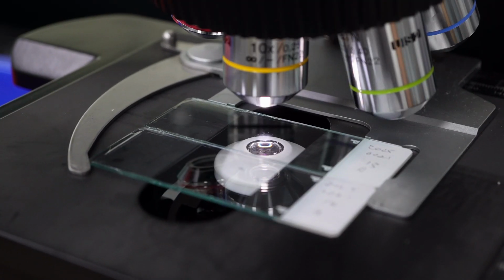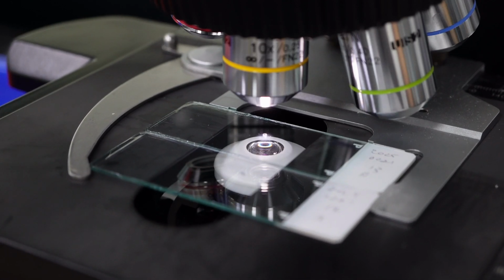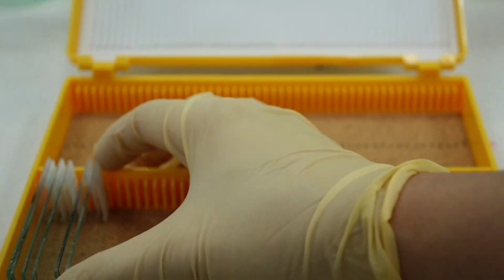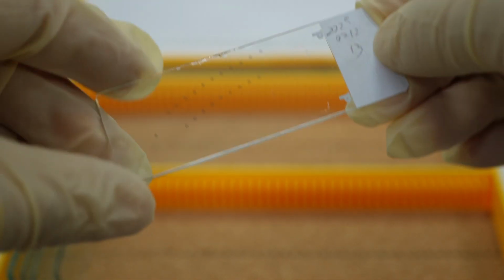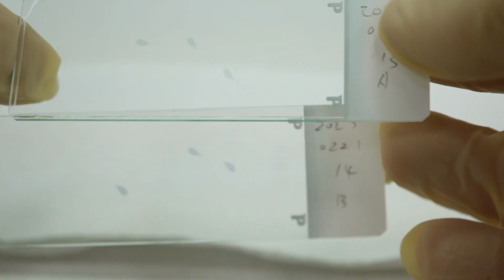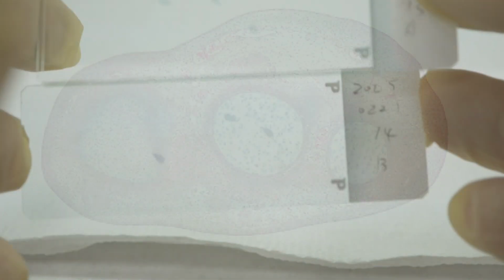And interpreting what you see, that's the next crucial skill. Right. How do you take these flat 2D slices and rebuild that 3D picture of the embryo in your mind? Well, that's the art and science of histology. You look at adjacent sections on the slide, section after section in that ribbon. You follow structures as they appear, change shape, connect to others, and maybe disappear further along.